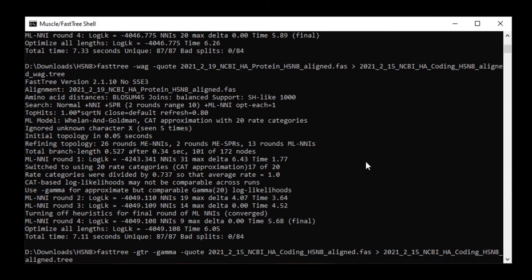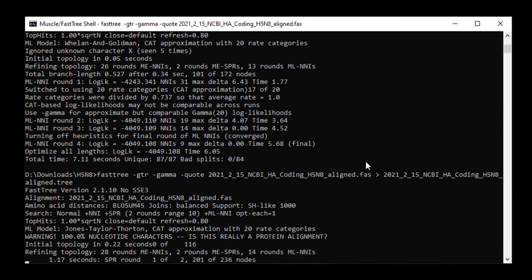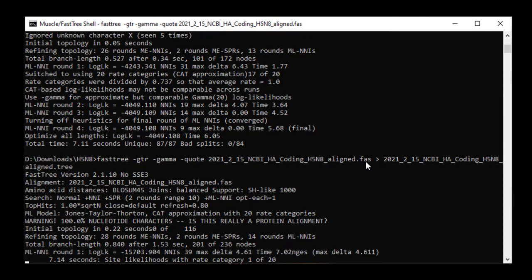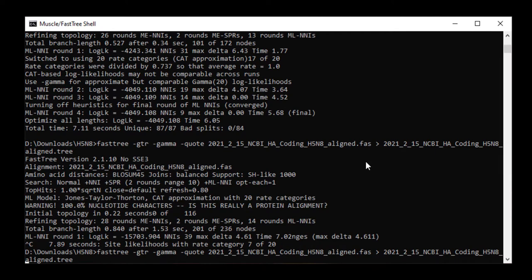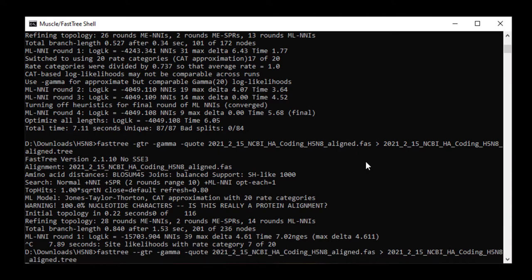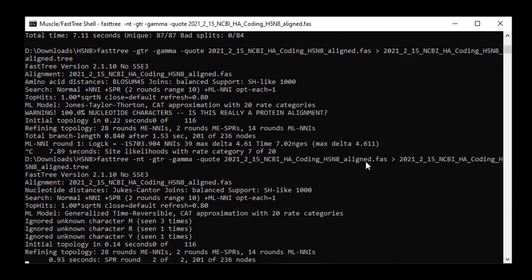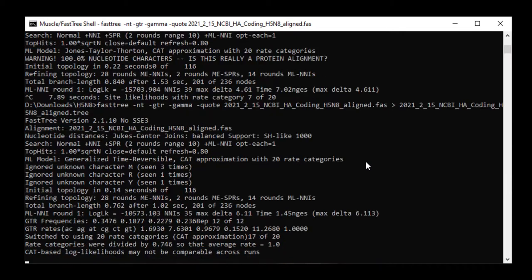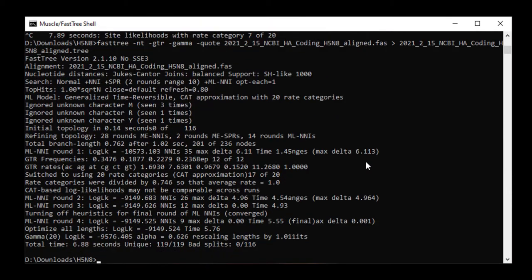This is because I had a warning about the nucleotide characters it says it's 100% nucleotide characters but it's trying to do an amino acid tree. So what I had missed is the -NT command line argument. You need to put this on to say that it's nucleotide so I added that and ran it again then it works successfully and I've completed my trees.